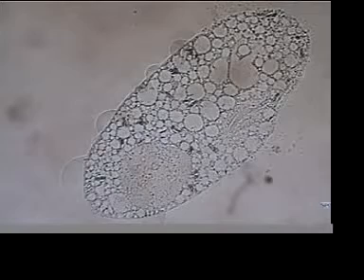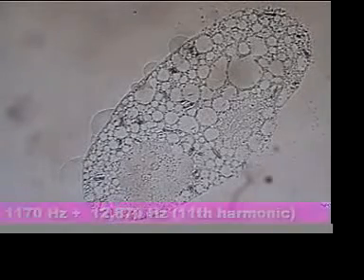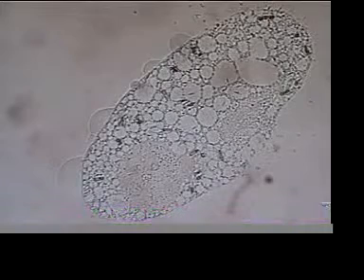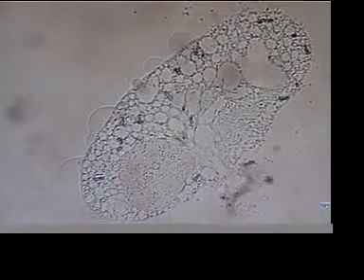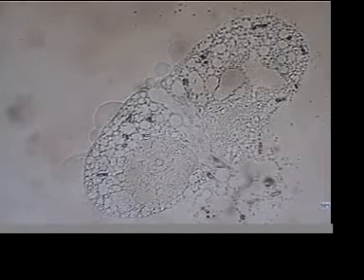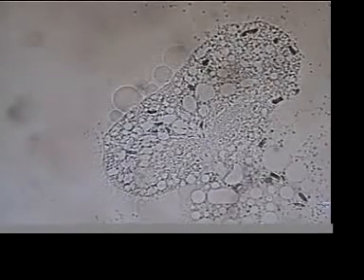Watch the internal structure all changing now. We were just lucky the camera was on. 200 seconds at 1170 hertz, and its 11th harmonic, 12,870. And he is completely devitalizing in real time. Completely destroyed in a very dramatic way here. Look at that. Notice the spheres forming.